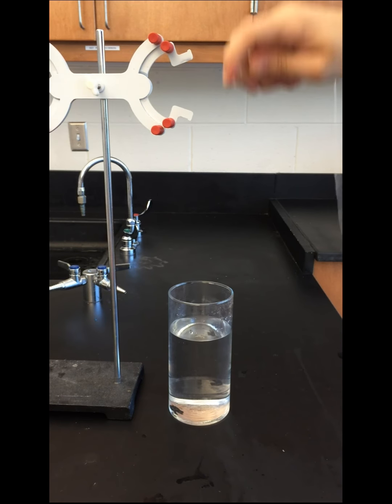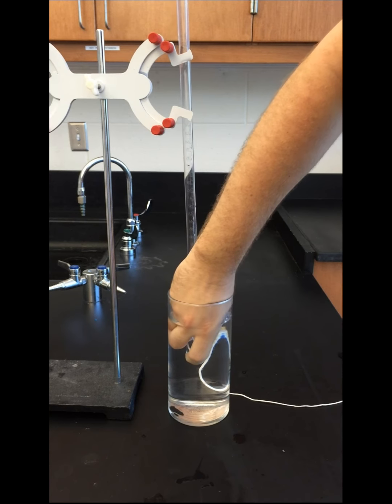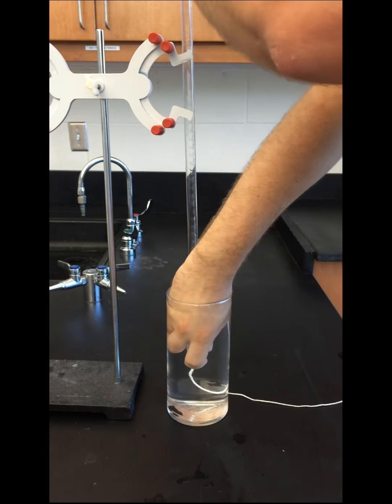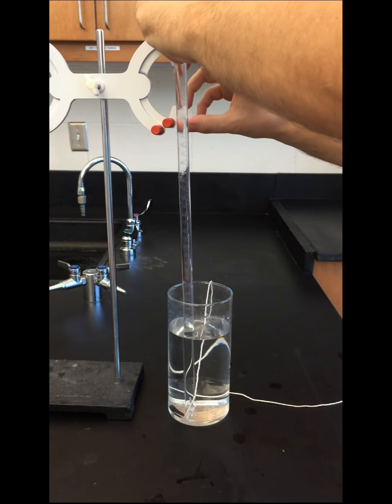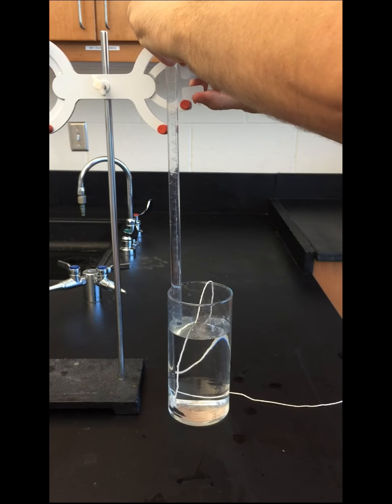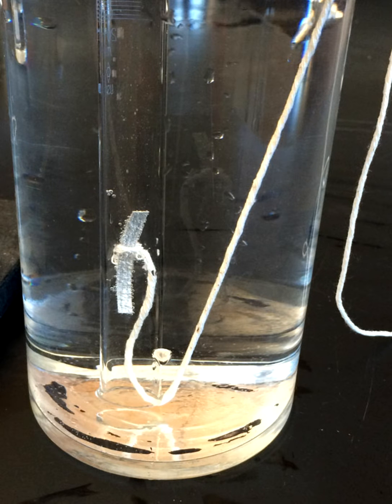Placing a finger over the open end, the eudiometer is turned upside down and inserted into the tall form beaker filled with water. The eudiometer is pressed all the way down to the bottom so as to make sure that the string is caught underneath it, preventing the magnesium from floating away during the experiment.